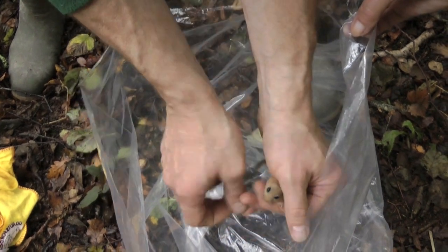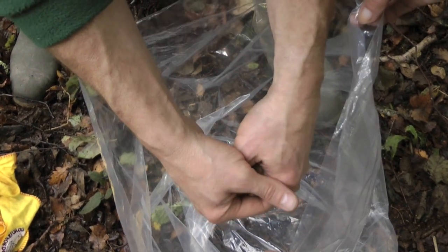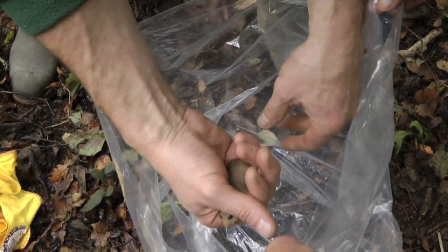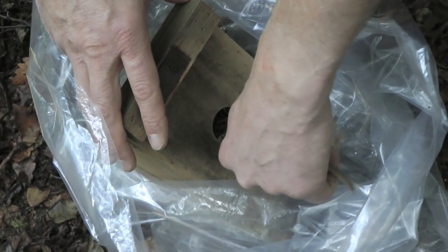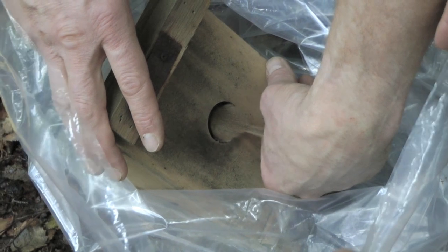After the animals have been weighed they need to be caught to be put back into the box. Again let them run between your hands — this time you want to get them on their front with their nose between your thumb and forefinger. This means that they can easily be posted back into the box.